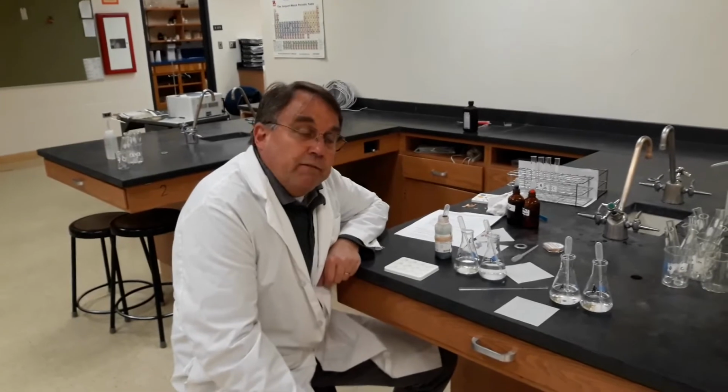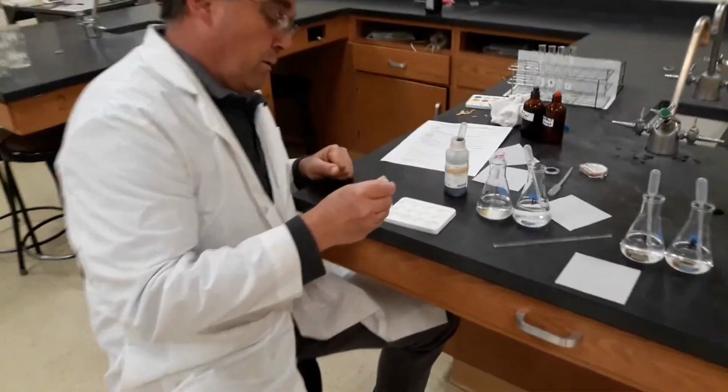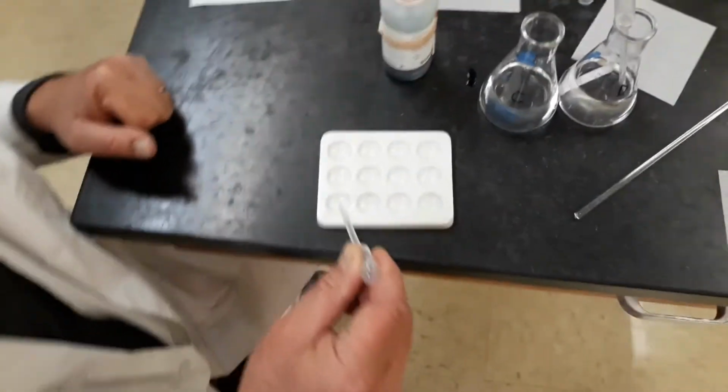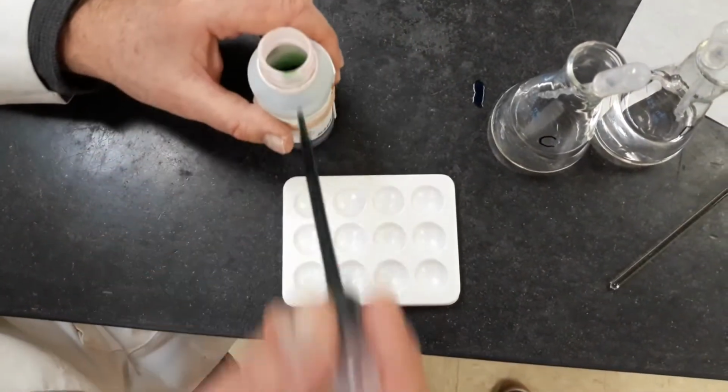So now we're going to do section G, effects on each other, and we're going to add 5 drops of C to the spot plate, and then a drop of universal indicator.